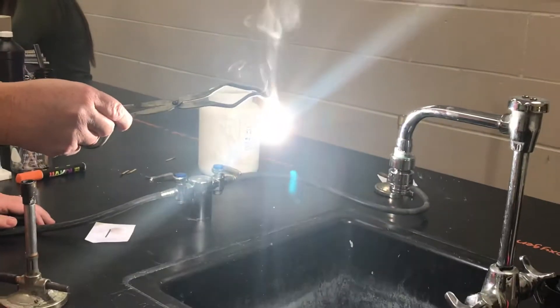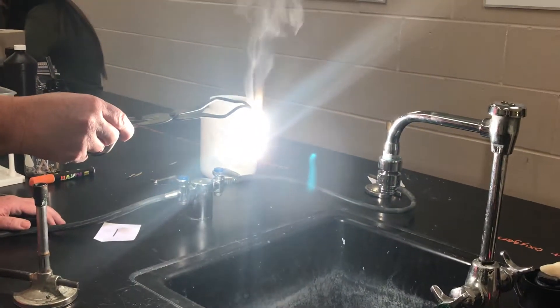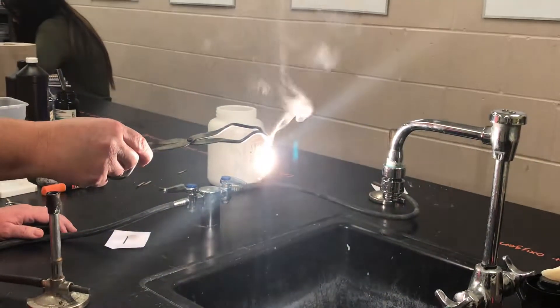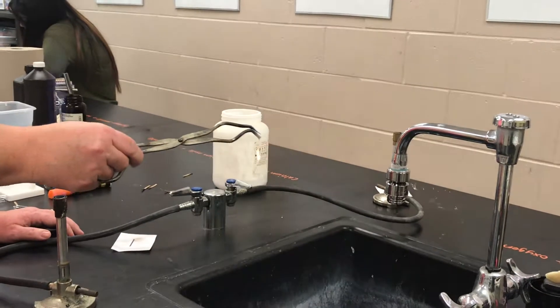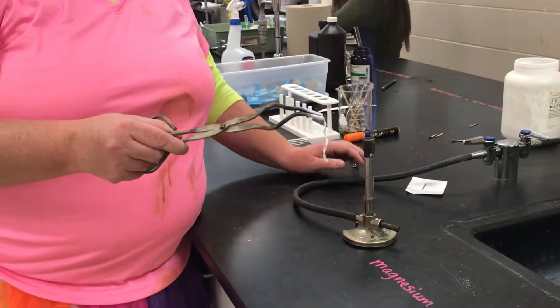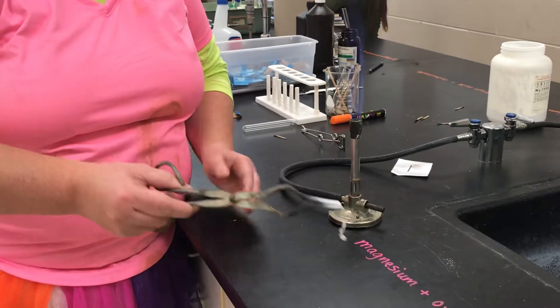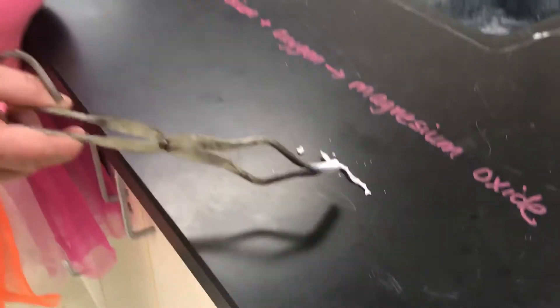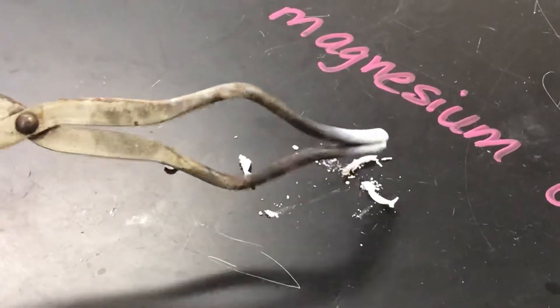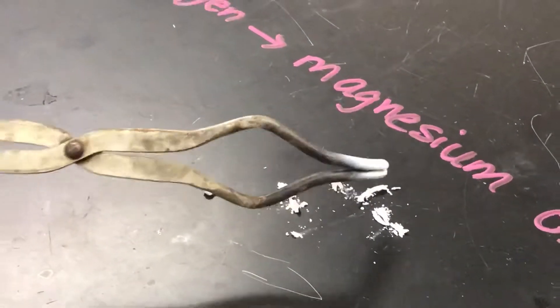Once the reaction starts, it produces a very bright light that I'm not looking at with my eyes, because it can produce a flash. It gives off intense heat and light, and it produces this white crumbly powder, which is the magnesium oxide.